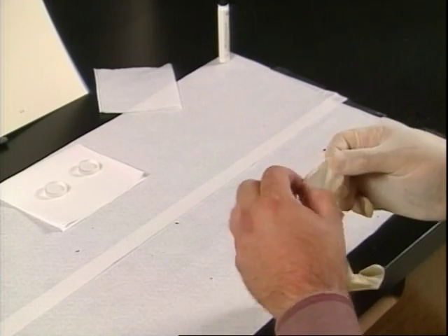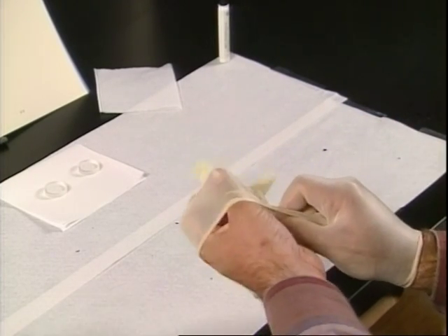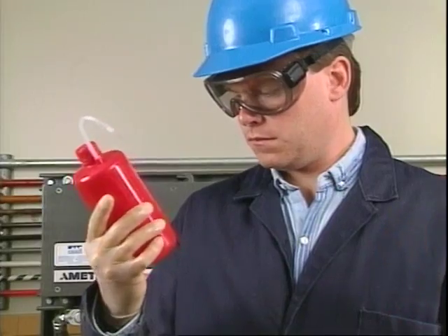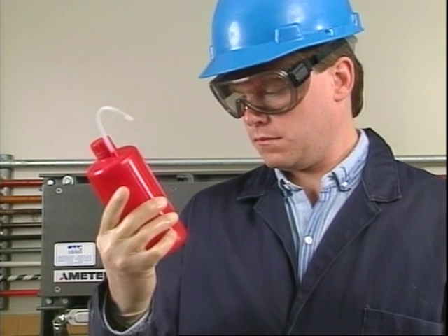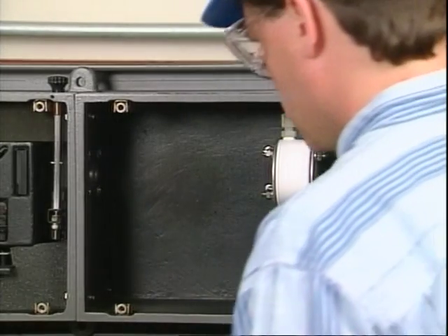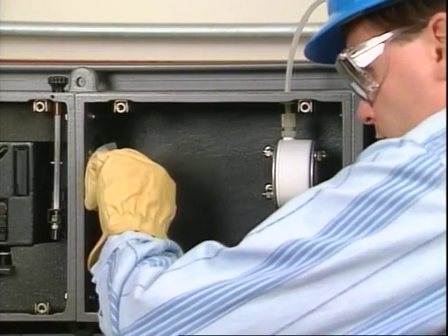Avoid direct contact with dangerous cleaning solutions and use the proper eye and skin protection as required. In some cases, respiratory protection may also be required. The chemicals and cleaning solutions that you use should be those recommended by the analyzer manufacturer and approved for use in your facility. Various analyzer elements require special cleaning procedures.